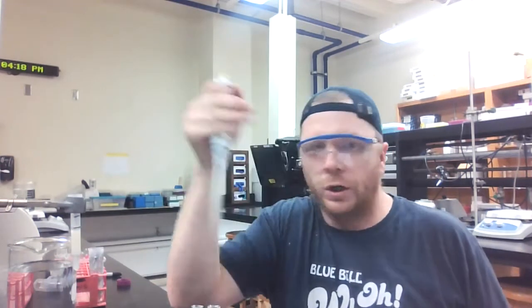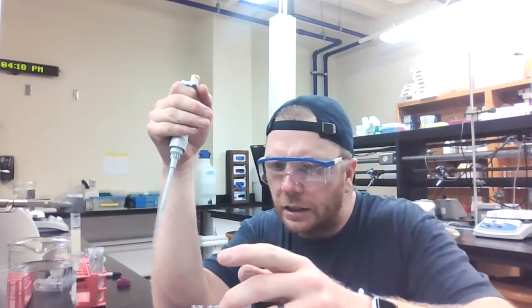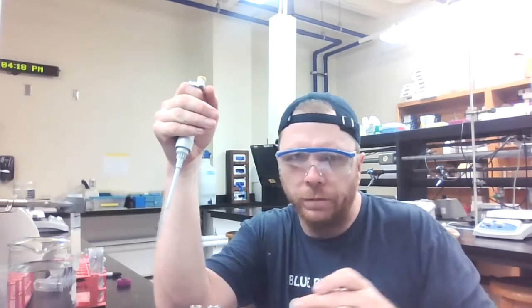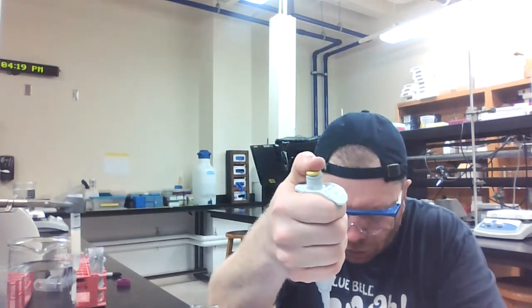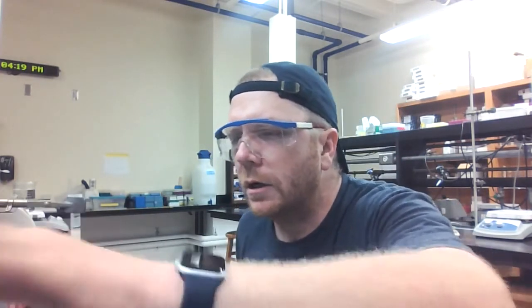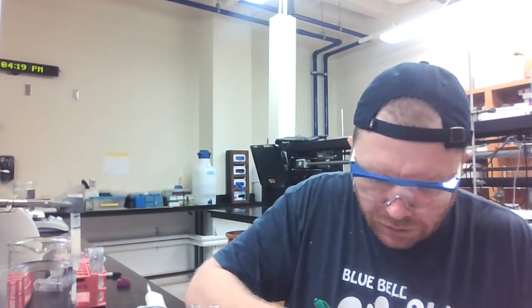Okay, so what I've decided to do is jump ahead. I have a total of 22 fractions. So I'm going to measure the absorbance of my 22nd fraction. I'm going to read my blank. Okay, now I'm going to read my sample. Oh, it became a little bit more blue. It definitely changed its pigment. Now I'm going to read my sample: 0.011. Okay, so I skipped 21, 0.011. What I'm seeing is that fraction number 22 has some protein, but it's not a lot of protein.